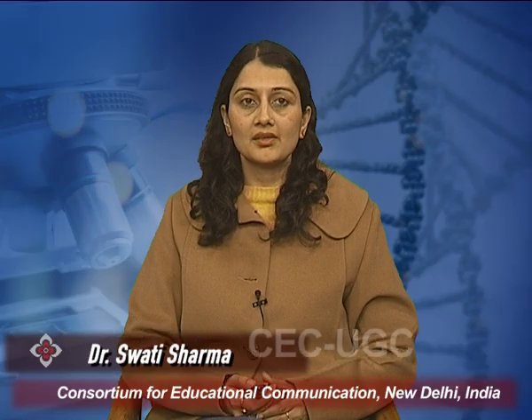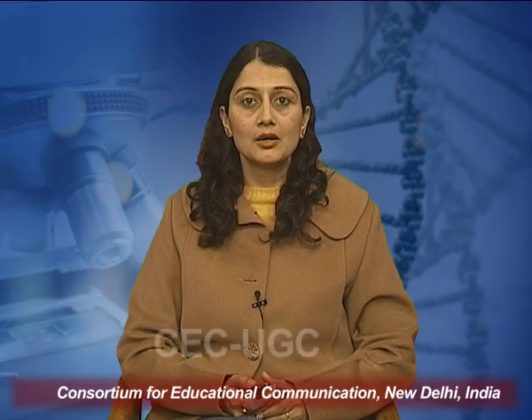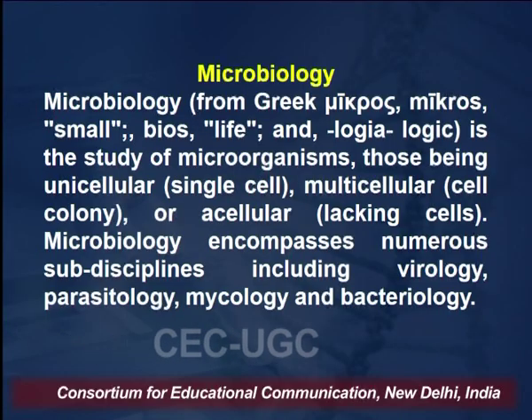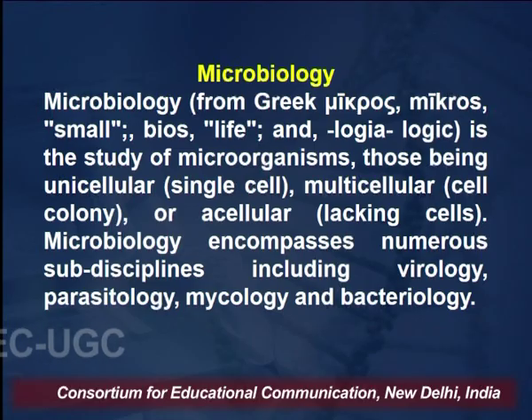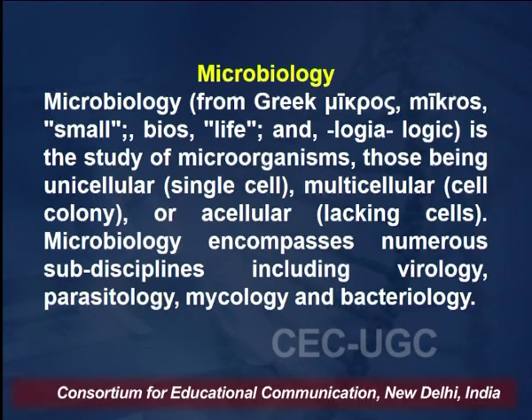Today we would be discussing the sterilization techniques which are used in microbiology. We first of all need to understand what is microbiology. The term microbiology is coined from the Greek word which consists of two words: micros means small and bios which means life. So anything which is living and needs to be seen under the microscope comes under the term microbiology.